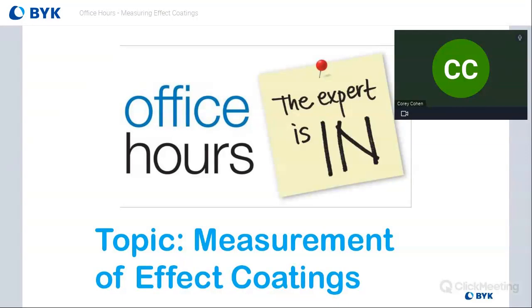So you want to mimic that illumination as closely as possible, especially when you're dealing with these effect pigments, where the interplay between the illumination angle and the observation angle is so important with the effect that you're getting. So directionality is important.